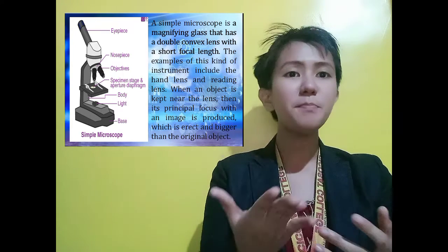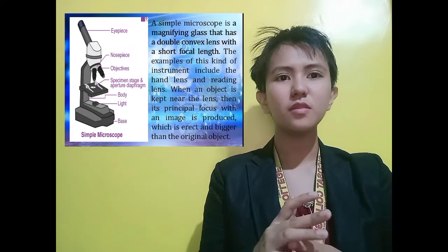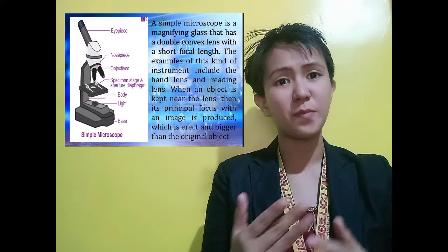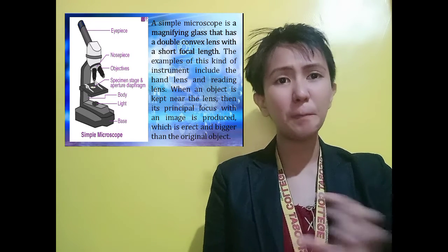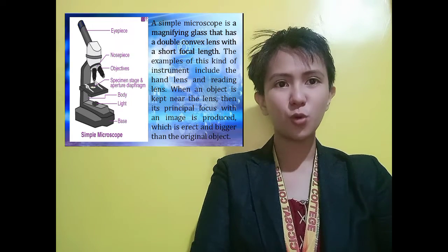So, dito sa simple lens, pwedeng sa reading, ito yung pinaka-simple microscope. Pwedeng pagtitignan mo lang siya, yung parang ganon. So, yun yung simple microscope.